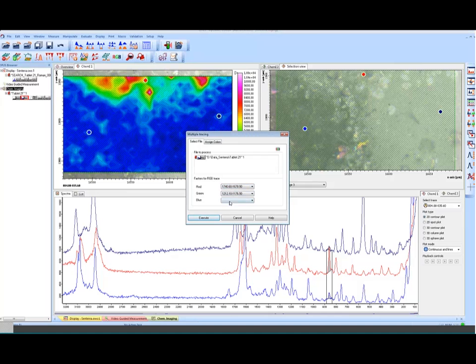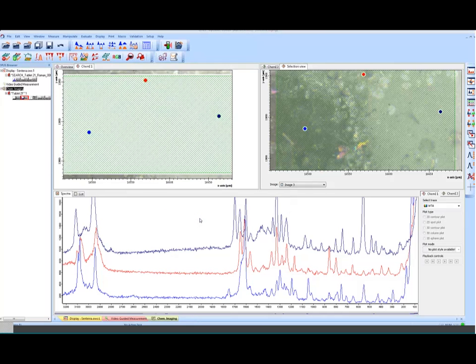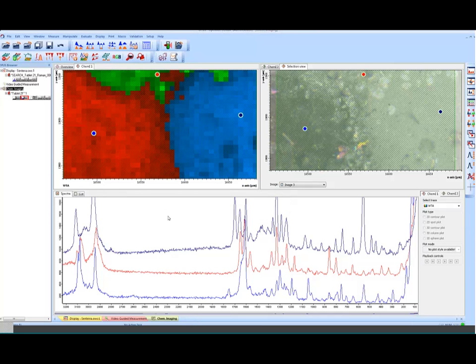We put in the 3 integration regions, and then say execute. And here you see the result. These are the three areas combined within one picture. Let's just compare this picture with the similar procedure which we have done in the beginning with the cluster analysis.